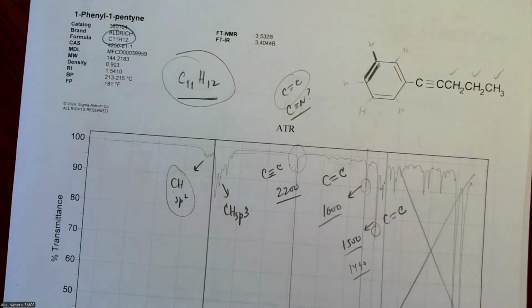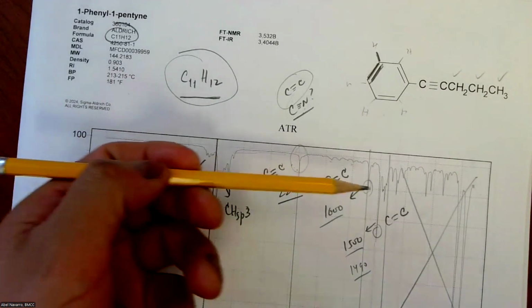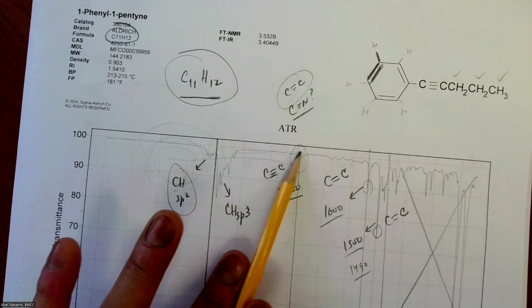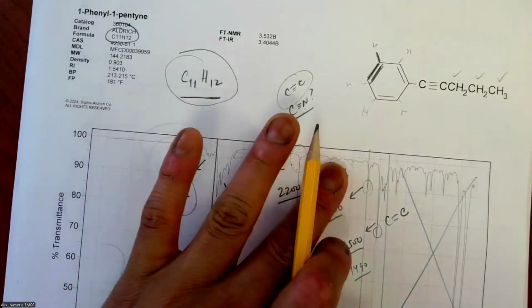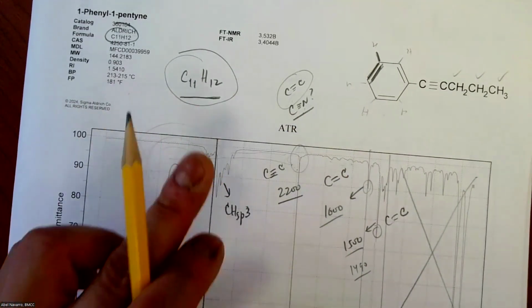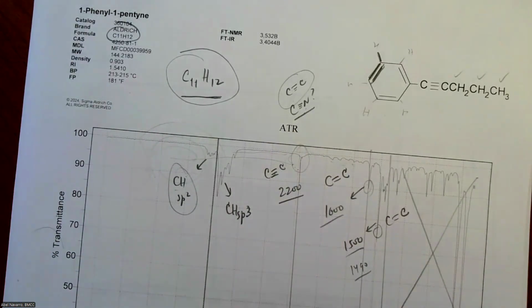Well, first try to analyze. Normally the nitrogens are seen here. Since you are analyzing your IR from left to right, you will discover any nitrogen here before you even try to look at that peak. That's why I recommend you do the analysis left to right, because here you see OHs, NHs, and that's what will come right next, CHs. Right now we're doing all CHs, but you will discover. So if there is no C-triple-N, it will be absent.